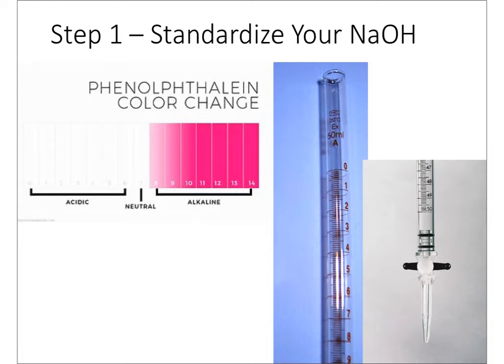Now, the other thing about this burette is the precision that we get, or the number of decimal places that you should be using when you calculate these volumes. So remember, you're looking at a meniscus, and this meniscus can fit in between lines on this burette. Now, between the points 0 and 1, this would be a volume of 1 milliliter, but I have a tenths place, or 1 digit, that I can also determine based on where these lines are. But there's also this gap in between.